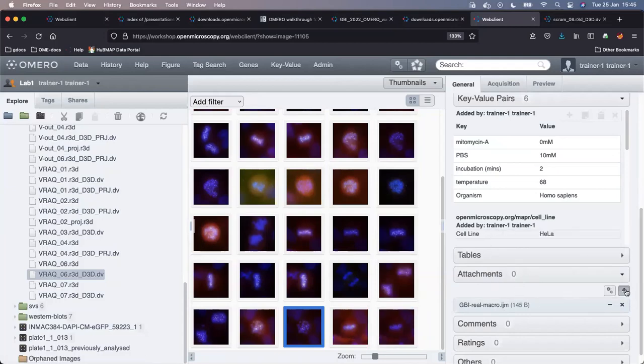Or indeed add some description files in the form of PDFs and CSVs. PDFs and CSVs will be then indexed by the big search I just showed. And in this manner, you can again hasten the overview of the images.